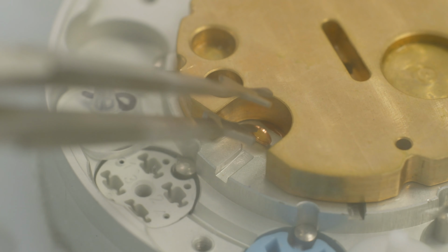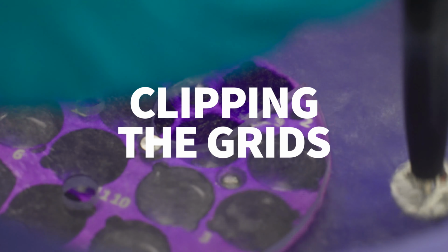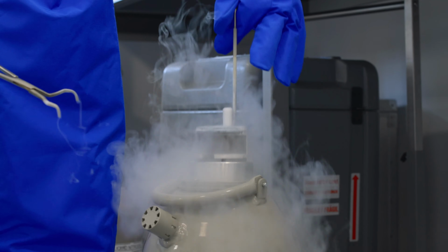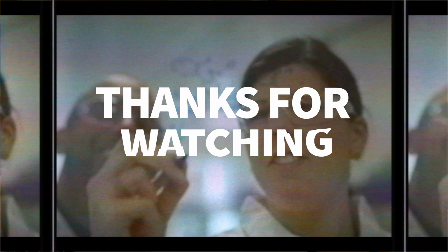And we're going to use this apparatus here that will let us basically do what we call clipping the grids to be ready for the screening. Once the samples are shipped in this container, we're going to analyze the data and then review it at a high resolution. And we will communicate this information back to our medicinal chemists for them to improve a bit more the design of this small molecule and hopefully improve patient life in general.